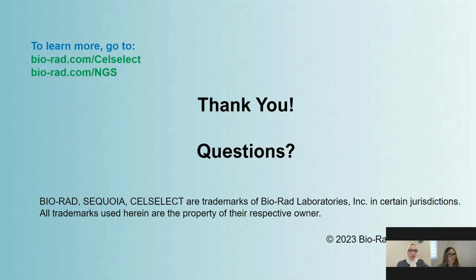Right now, the maximum blood volume that we can process through the system is 4 ml, which is diluted 1 to 1 with PBS, so a total of 8 ml of sample. And there were many researchers interested in processing animal models, for example the mouse model, with very low blood volume, for example 200 microliters.